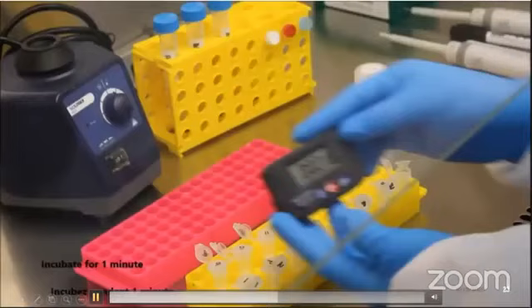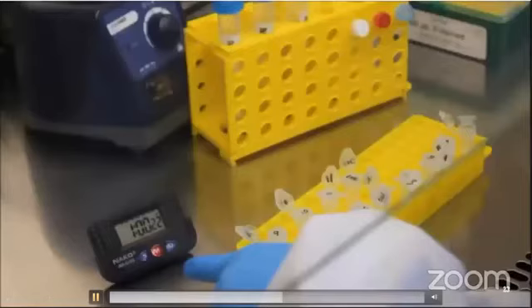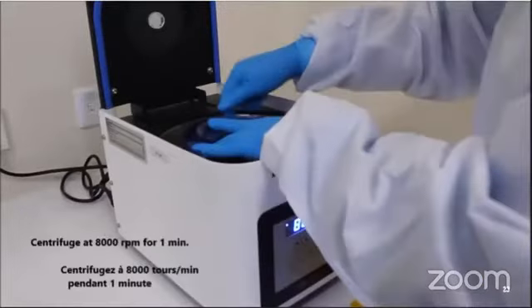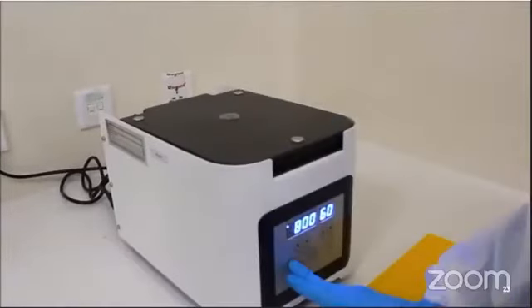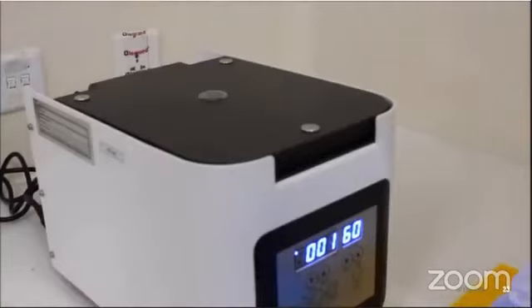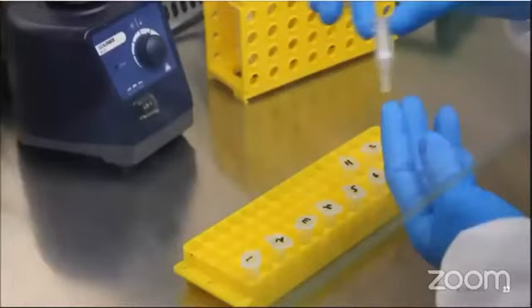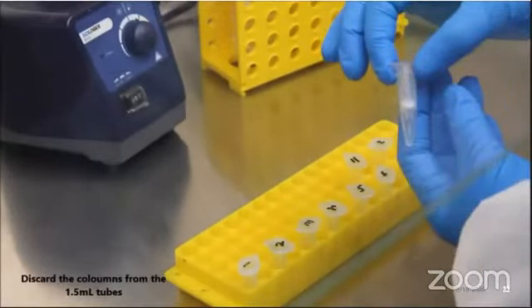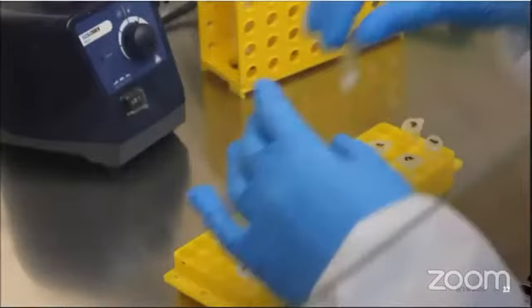This elution buffer is actually made up of RNase-free water with sodium azide. This sodium azide prevents the microbial growth and works as a preservative. Now incubate for 1 minute and centrifuge at 8,000 RPM for 1 minute. Take out all the columns and keep the Eppendorf tube containing the RNA in the rack properly labeled.